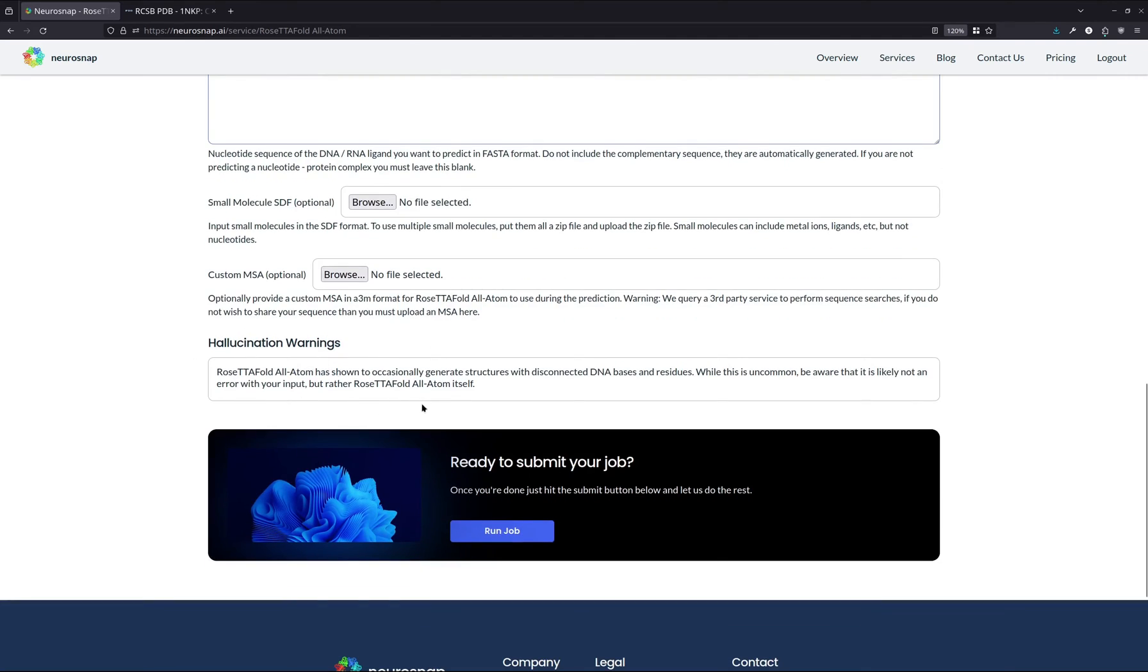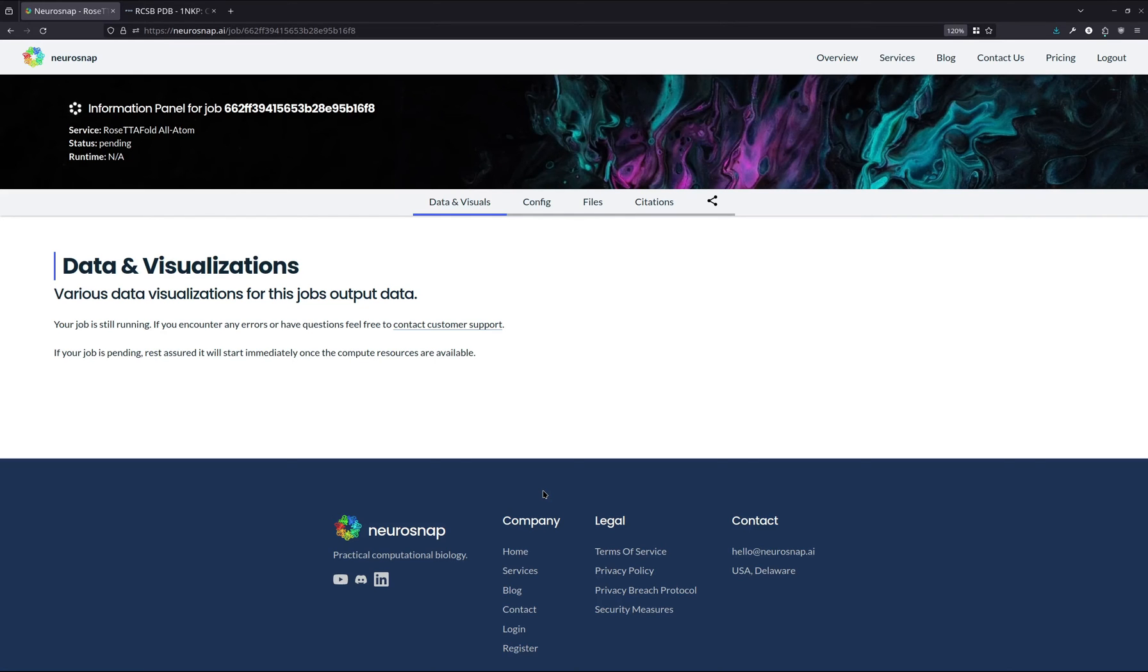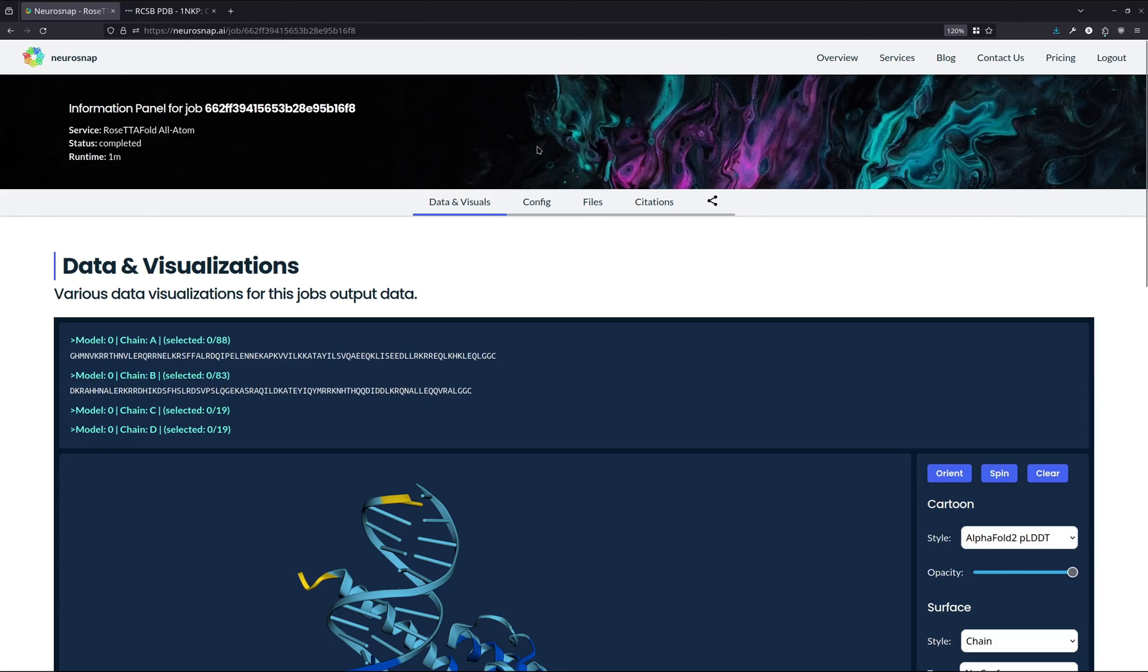So now that we have our inputs that we want for this demonstration, we're just going to hit the Run Job button and we'll let the Neurosnap platform do the rest. In the meantime, you can go do whatever. You'll get an email once the results are ready. And typically, it doesn't take too long for these types of smaller demonstrations and simulations. We are now back with the results.